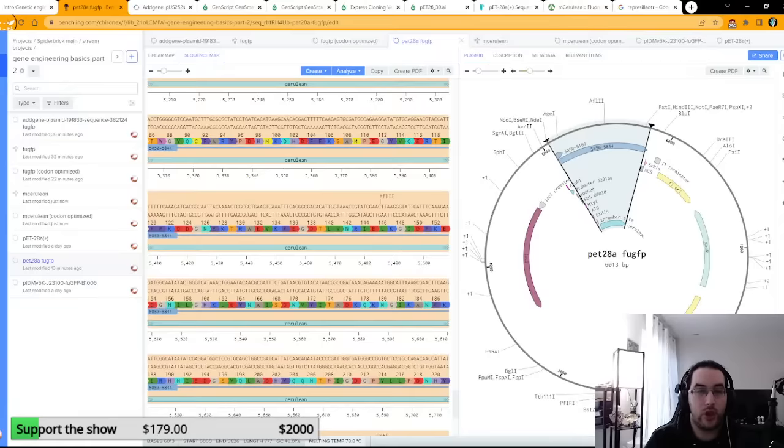So for those of you who caught the neuron stream, it was almost a year ago now. The first step was building a mammalian incubator for actually physically growing the neurons. That is now complete. The neuron incubator has been built. So we're just testing it out with some skin cells first. And if those grow properly, then the next step is growing neurons. I'm also working on a system for turning skin cells directly into neurons.